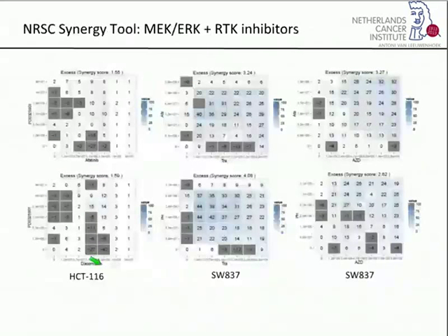And again, when you look in these cell lines, you see this combination and synergy discussed before. But in another colorectal cancer cell line, HCT116, that also carries a KRAS mutation, we don't observe this synergy. But we also know that in this cell line, they also carry a PI3 kinase mutation. So presumably, the activity of the PI3 kinase can counteract the combined inhibition of MEK and ERB3 in these cell lines. And therefore, of course, you need to direct towards another combination. So again, illustrating that there's a need for a high flexibility of a platform where you can rapidly screen drug-drug combinations through many different cell lines in different concentrations and different combinations. And the HP Digital Dispenser, of course, is an excellent tool to perform these studies.